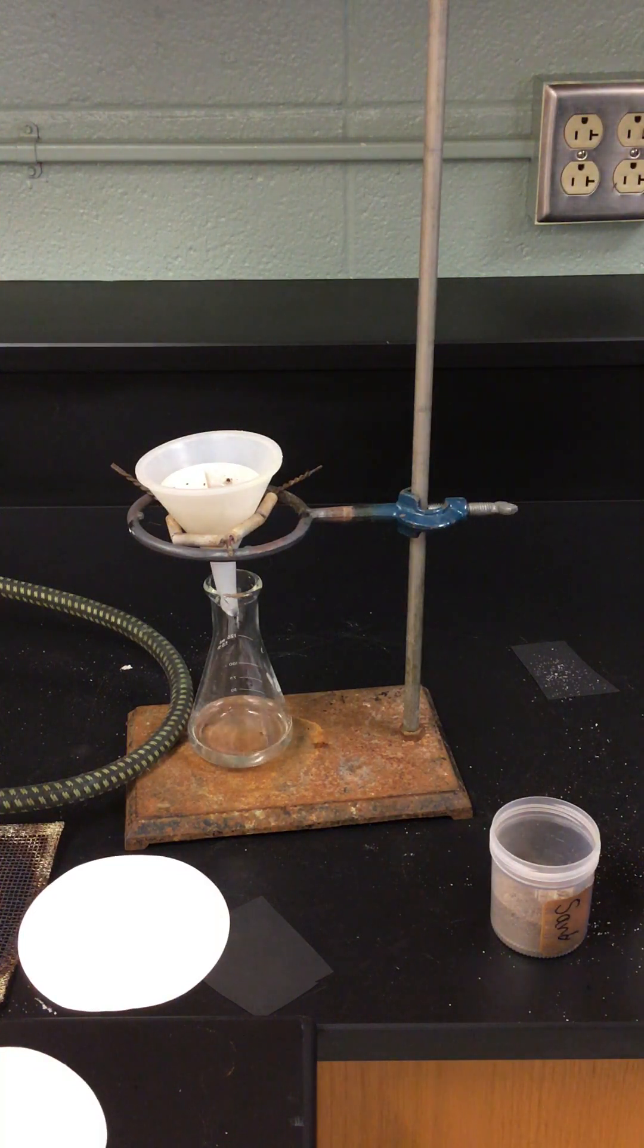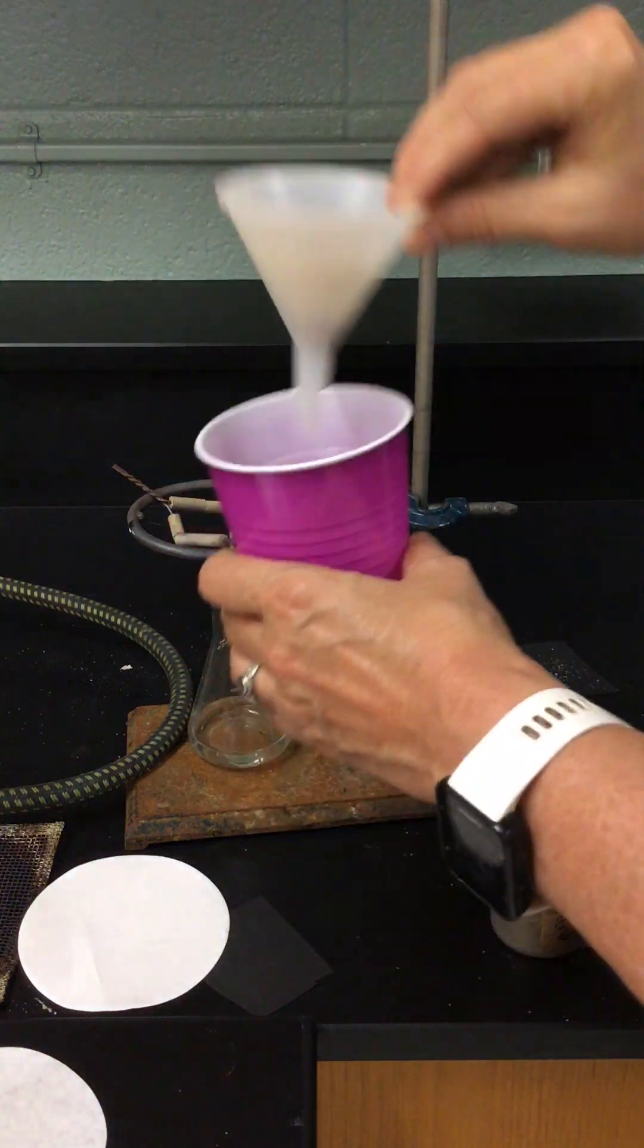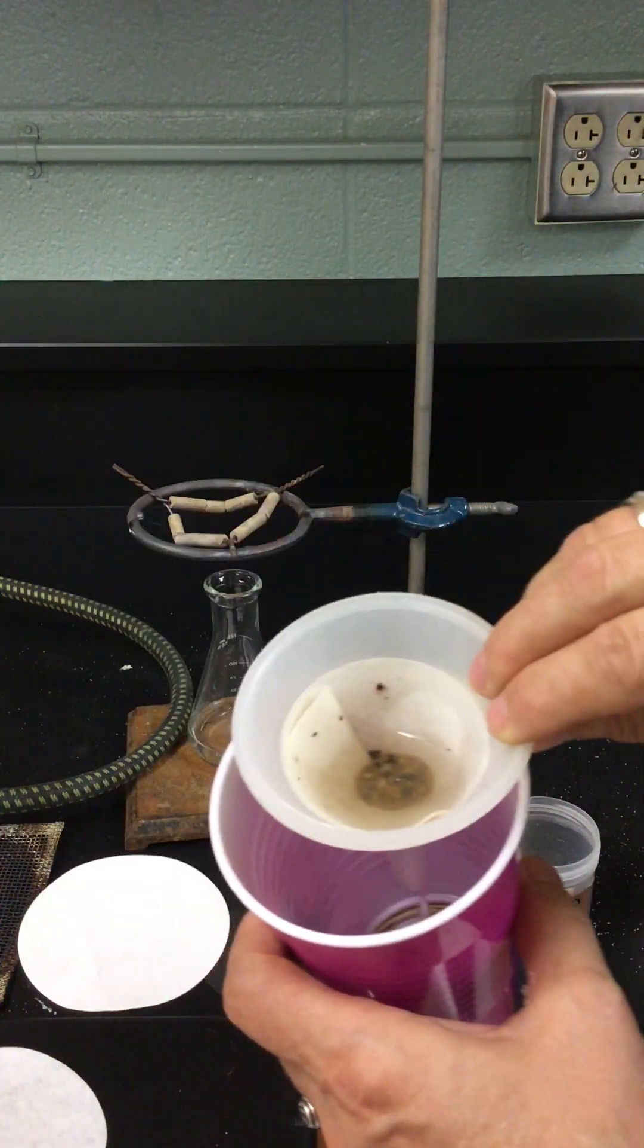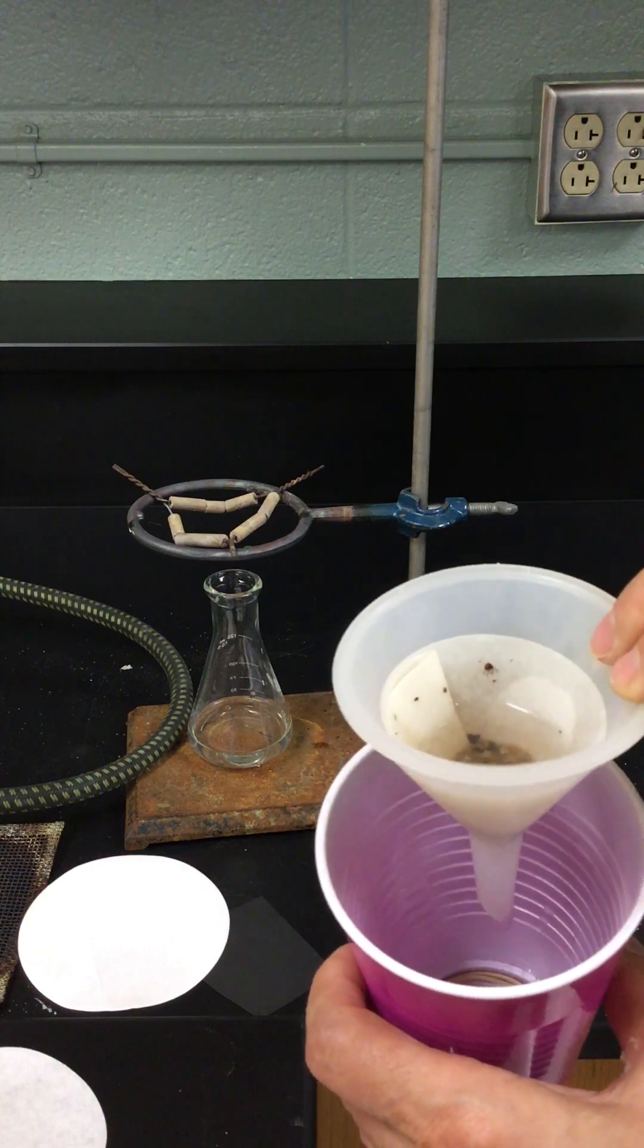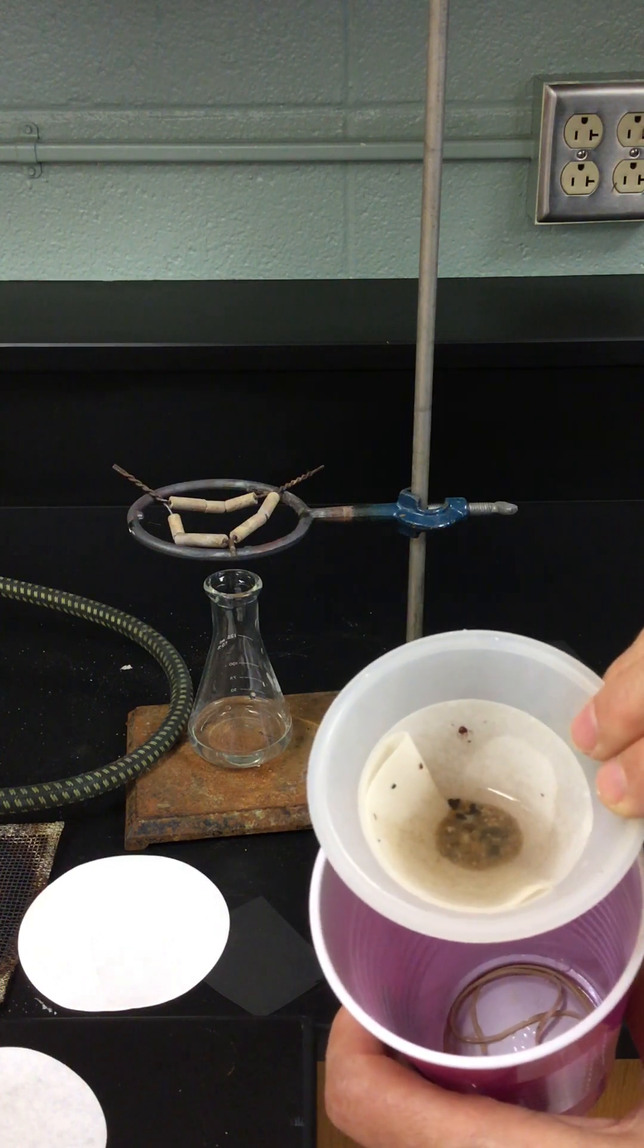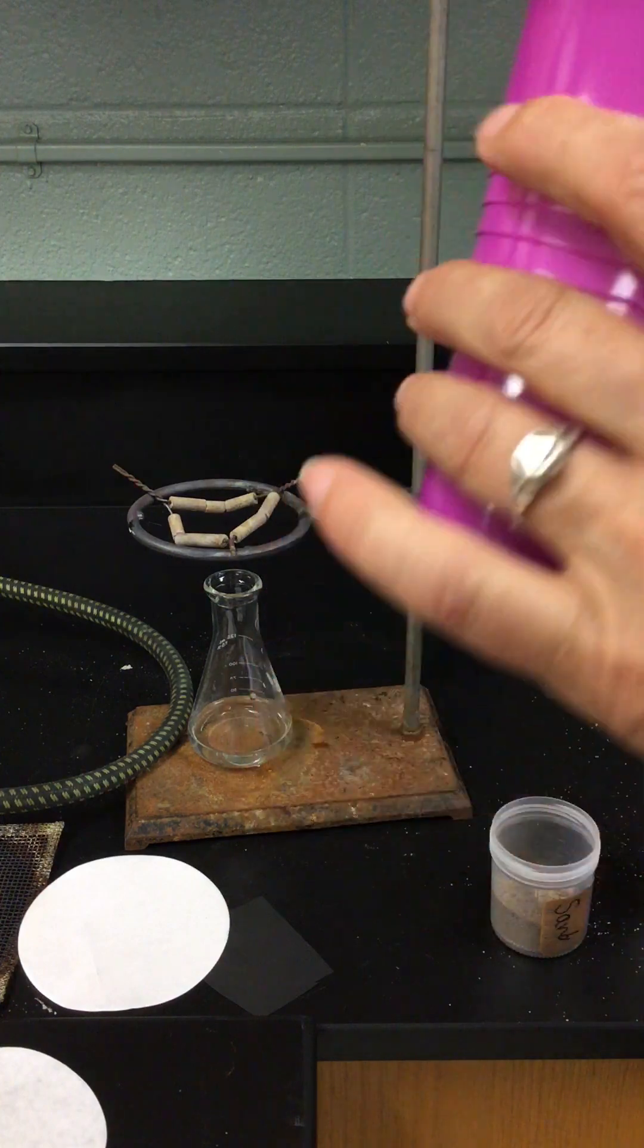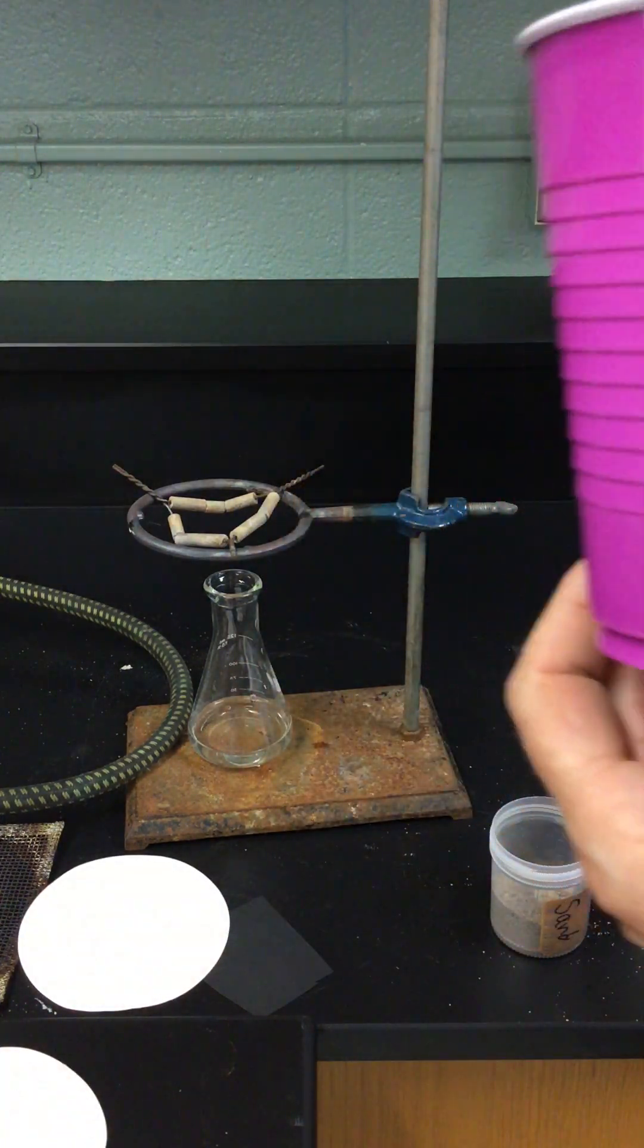We've got enough of the filtrate now. The filtrate is what goes through the filter. We've got enough. I'm going to take a look at what's in here right now. You can see what's on the filter. I'm going to let this continue to drain into this high level lab equipment, this plastic cup.